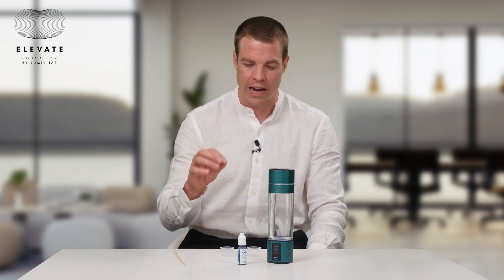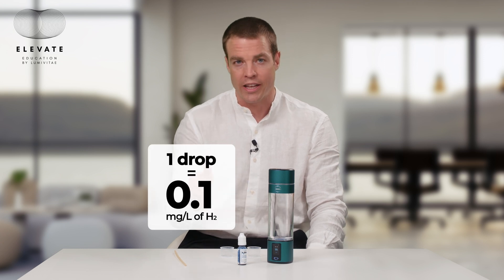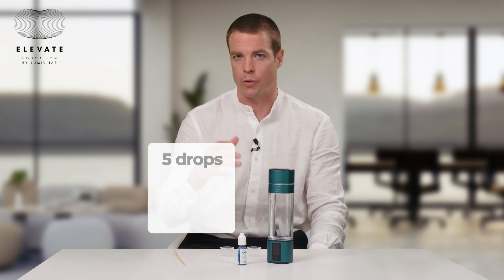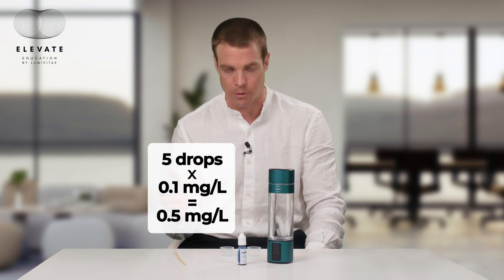So many people try to do testing of the hydrogen concentration, which is important because there are a lot of products out there that don't make even detectable levels of molecular hydrogen. The most simple way to test is using this reagent, the H2 Blue. It's more of an art than a science. It has methylene blue in it, and it reacts with hydrogen molecules, converting the methylene blue into leucomethylene blue, which is a translucent or clear form. Every drop of reagent you put into the hydrogen water that turns clear is equivalent to 0.1 milligrams per liter. You continue adding drops stepwise until you reach the titration endpoint, which is when you add the last drop and it turns blue and stays blue. So if you added five drops, that's 0.5 milligrams per liter.